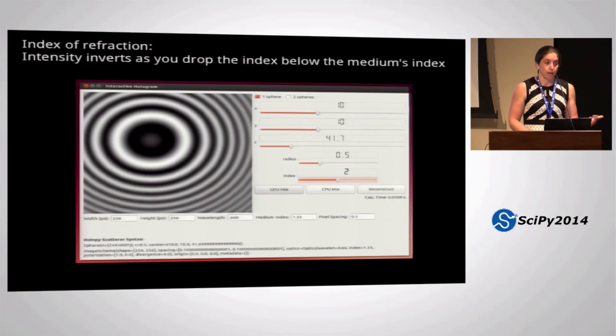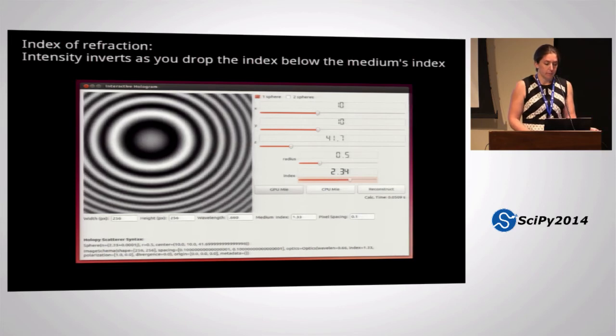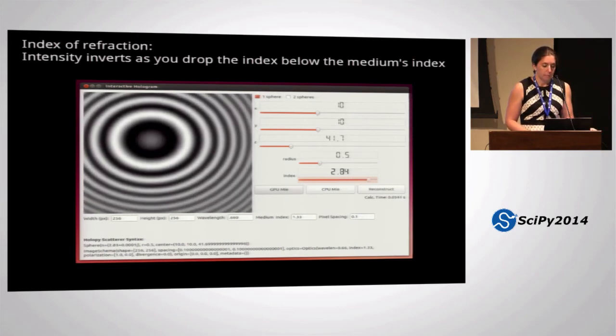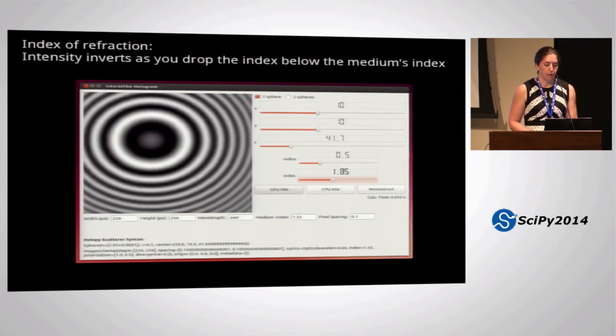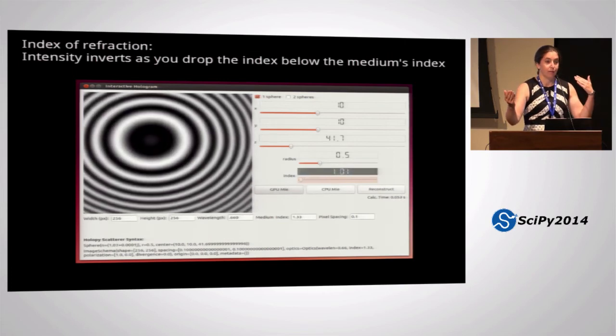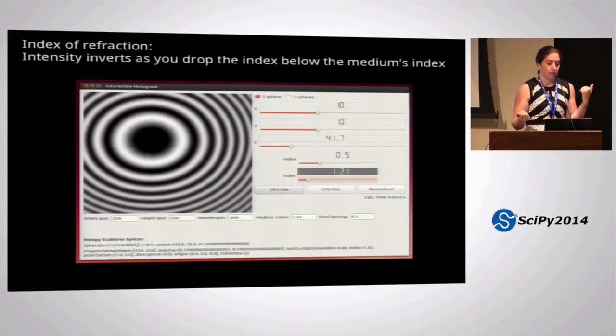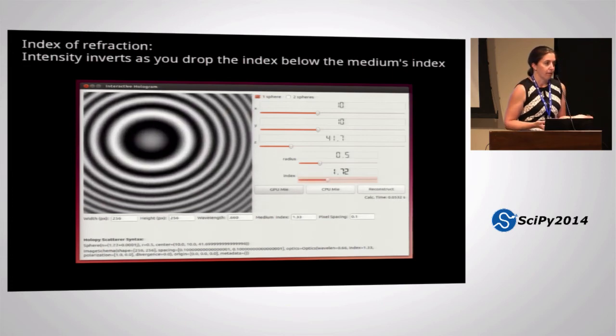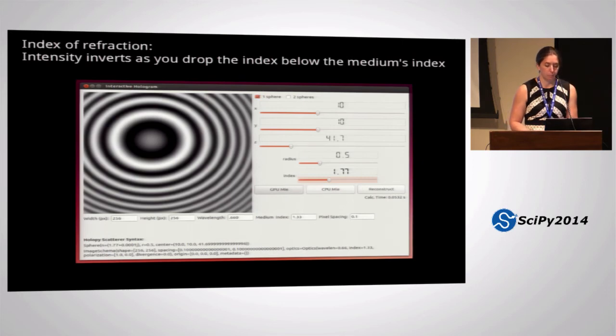Here's something that I didn't know until I played around with it in the GUI. I'm changing the index of the material here, and it's important to think about the index of the material relative to the medium that it's in. Here I have the medium set to 1.33, and as I bring the medium of the particle down through 1.33, you see that it flips. There's this switch in intensity that I didn't know to expect there, and never would have thought to investigate that with the theory. And so that kind of suggests to me some interesting experiments. Right now we work with particles that just have a fixed index all the time, but it could be fun to look at a material that's very close to the index of the background and varying.